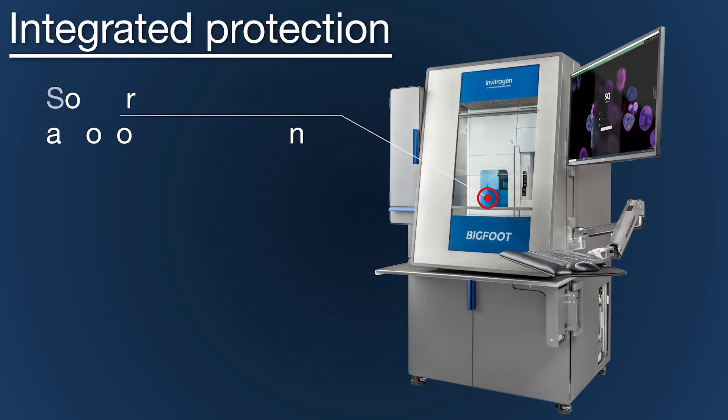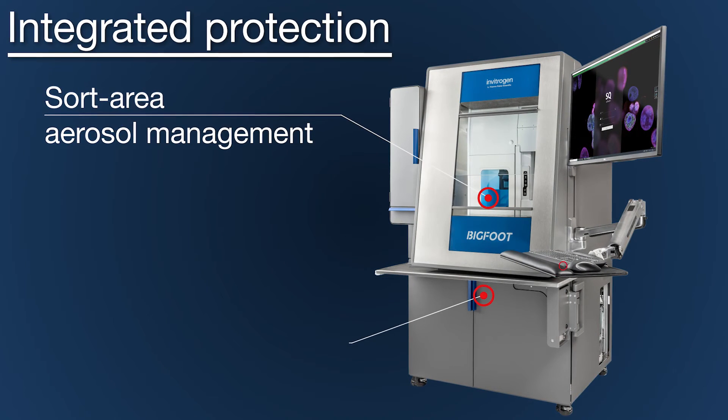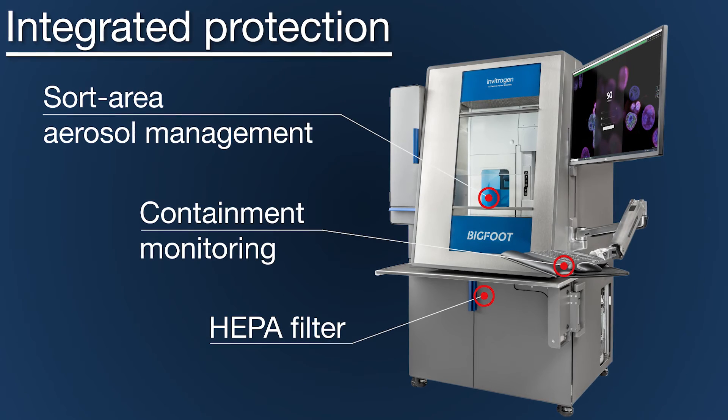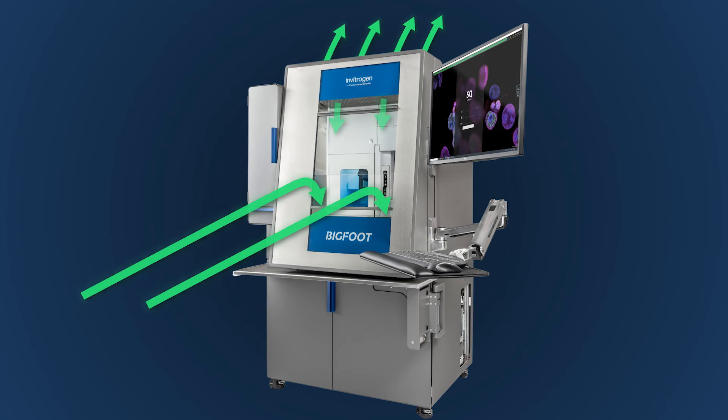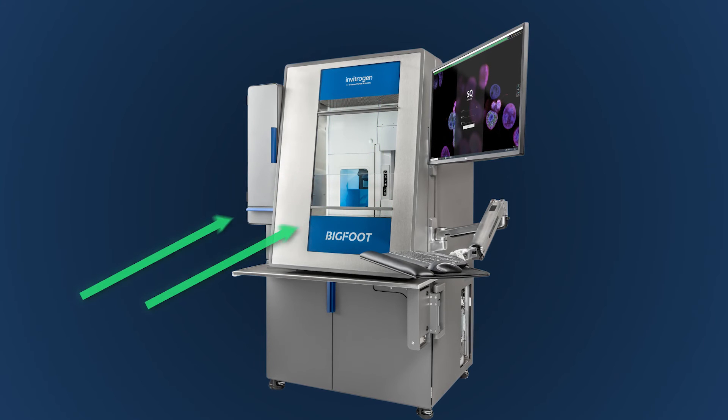A dedicated sort area aerosol management system, HEPA filter, and integrated software communication provide containment warnings and increased flow to maintain protection if a clog is detected.